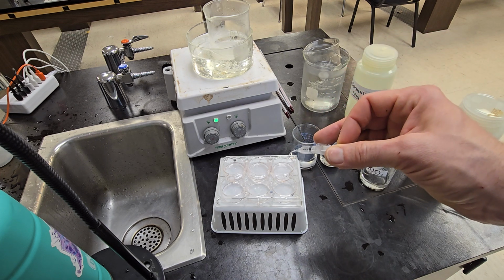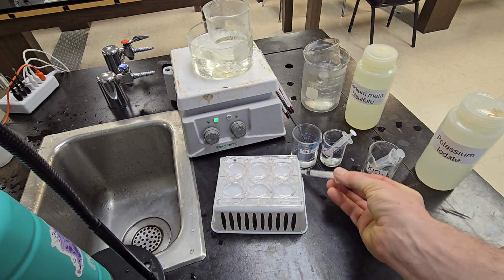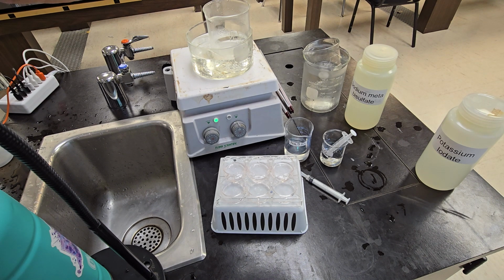Plate number 3. 2 milliliters each of the sodium metabisulfate. First, we will do room temperature potassium iodate. 3 milliliters of our product.